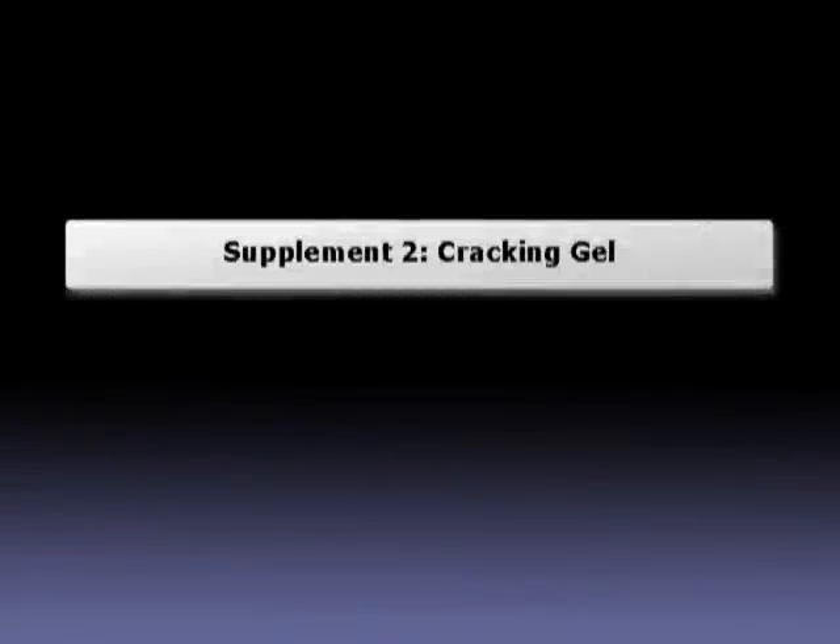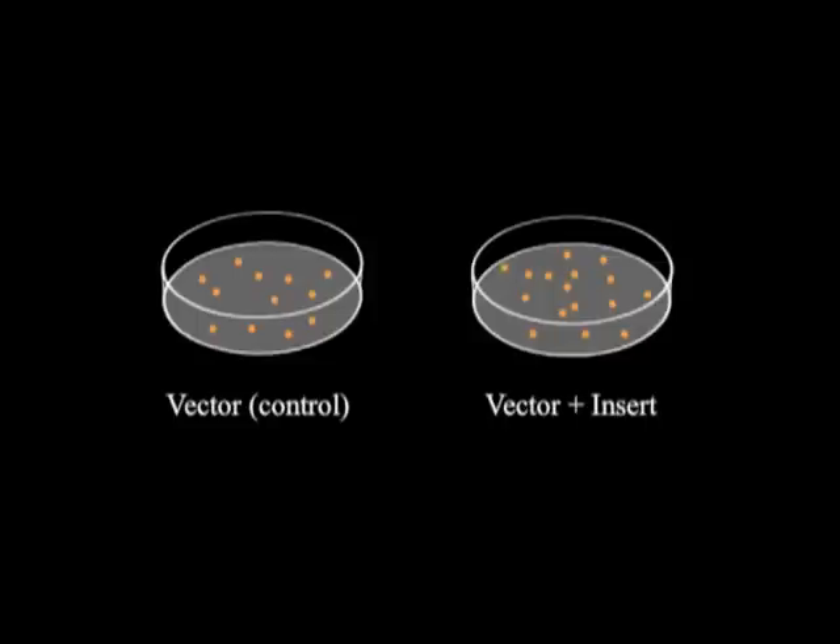Supplement 2: Cracking Gel. But what if you do have colonies on the Vector Plus insert plate, but they don't carry the clones that you want?